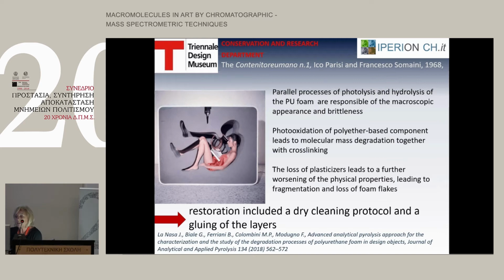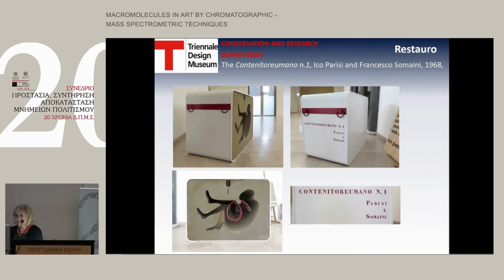So this is the main cause of the fragmentation and the loss of foam flakes that we have observed. And with this new knowledge, the restorers decided to make a dry cleaning protocol and to glue all the layers in order to restore some elasticity to the foam itself. Well, this is just one example, and you can go there and see the final results, which seem quite good for contemporary art.